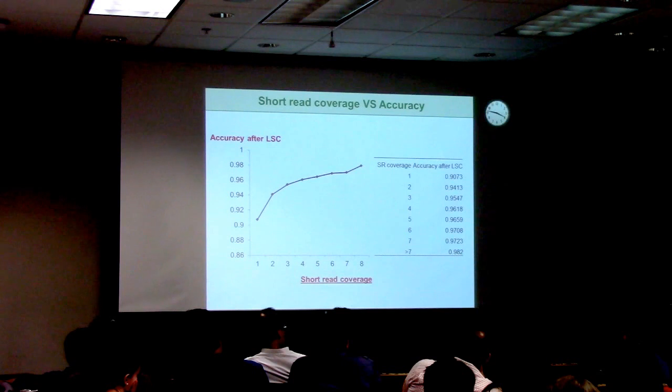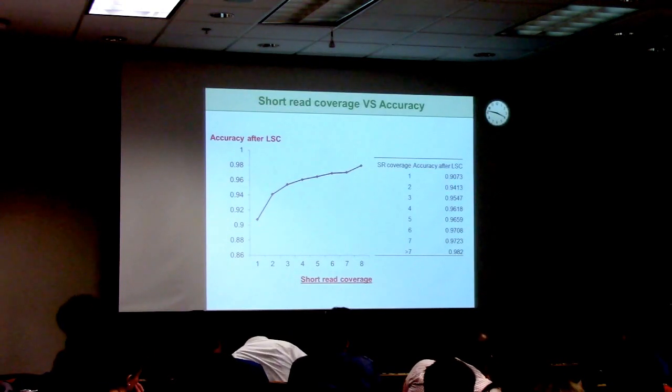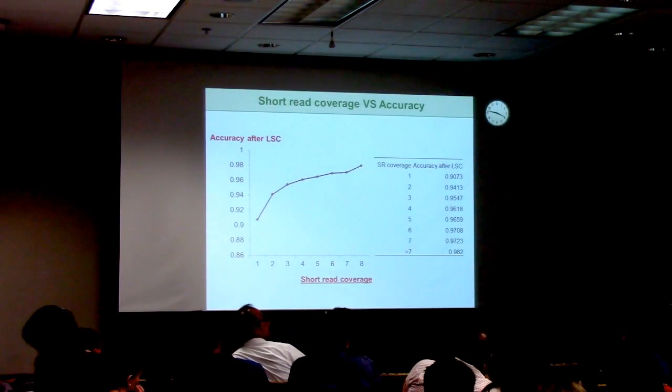You are totally right. And actually, we tried different strategies. For example, we tried saying, if you have only 3 nucleotides, the homopolymer length is 3, and then we compress to 1, and longer than 3, we compress to 2, something like that. It cannot help much better than that.